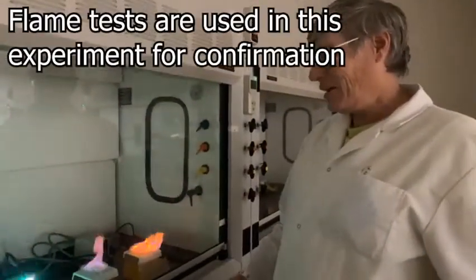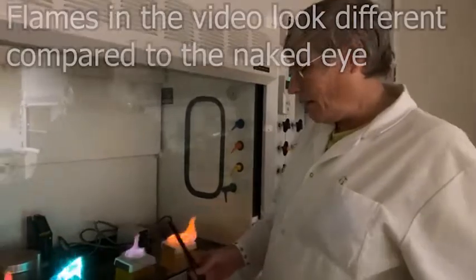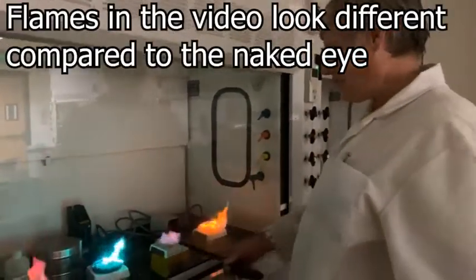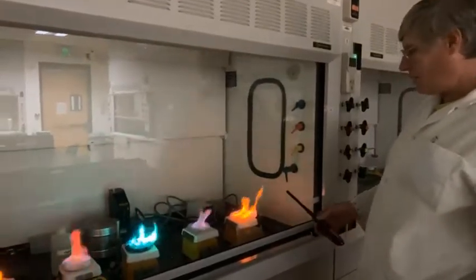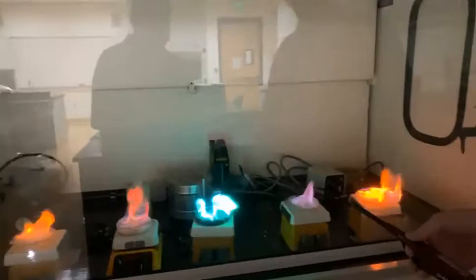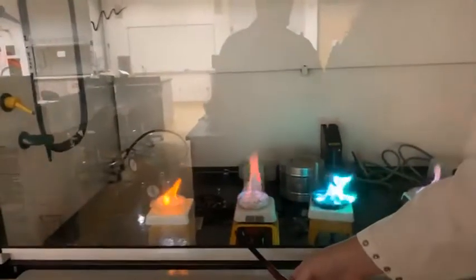Okay, we have here an example of the excitation of metal cations. They are used in making fireworks, and the classic colors are shown here. We get this orangish color from calcium glowing, this purplish blue color from potassium. The lovely green flame is copper. The reddish flame comes from strontium, and sodium makes a lovely yellow flame.